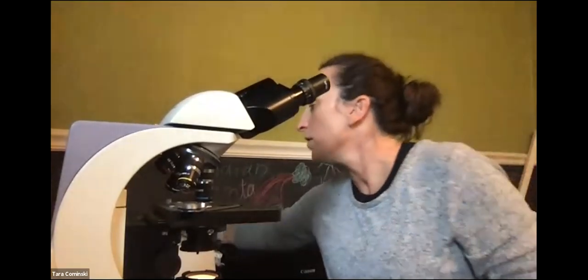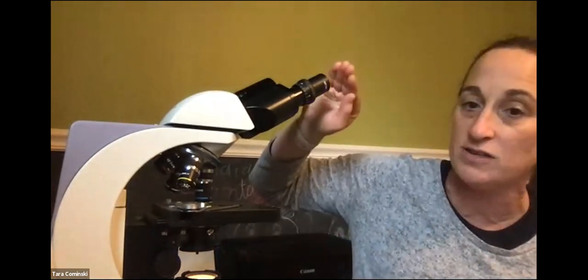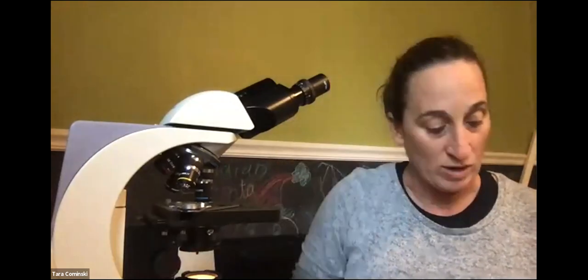Okay, so we're back to our lab handout. Let's flip now to page 22, okay? And 22 at the top talks about total magnification. So what is total magnification? It is the magnification of the ocular lenses times the magnification of the objective lens. Right now we have the high power or the 40x objective there. So what's the total magnification if I'm using that 40x objective? It is 40 times 10, hopefully we can do that math, which is 400.